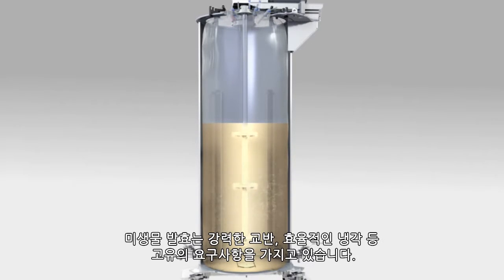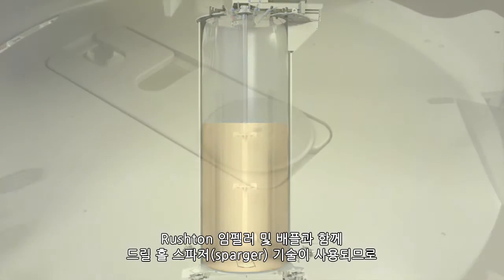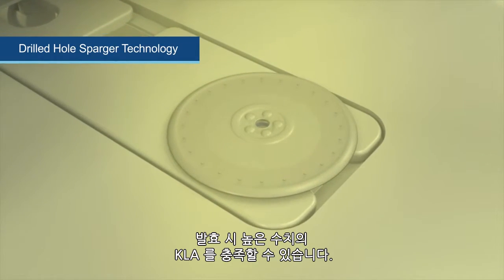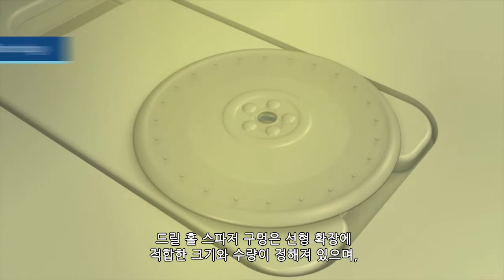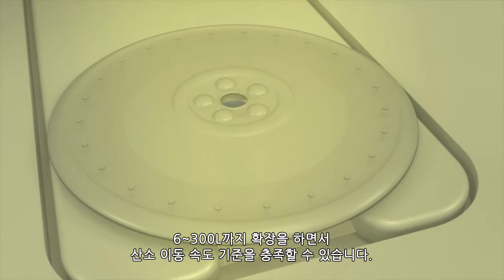Microbial fermentation has unique requirements, such as powerful agitation and efficient cooling. The drilled hole sparger technology, working with the Rushton impellers and baffles, helps meet the high KLA requirements for fermentation. The drilled hole sparger pores are a specific size and quantity tailored for linear scalability to meet your oxygen transfer rate criteria when scaling from 6 to 300 liters.